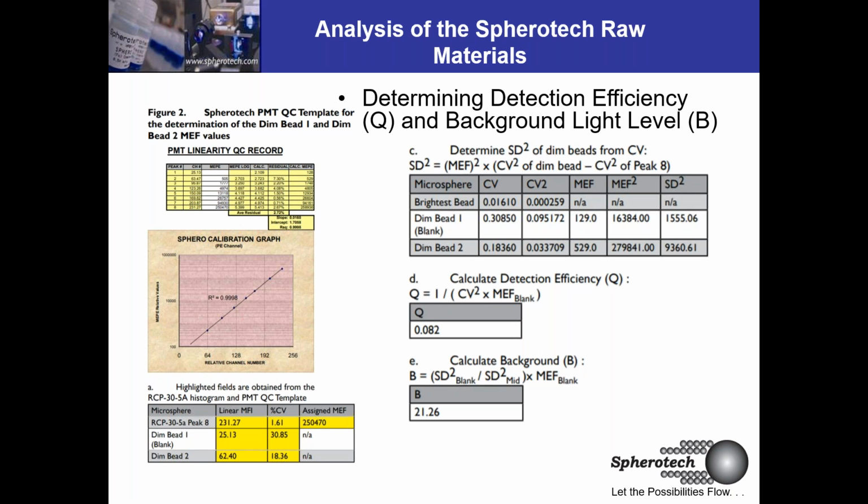And the other reason why this is really powerful is because a lot of the time you'll notice if you play with the voltages, your first peak might go to a negative mean value. And since we're doing logs, you can't do the log of a negative value. So there's an area with which you can't say something with confidence inside of your instrument. So essentially what this does is it creates a linearity or a regression line into that unknown area.